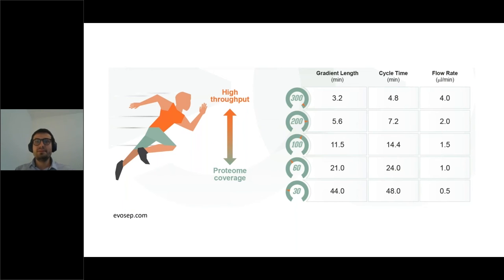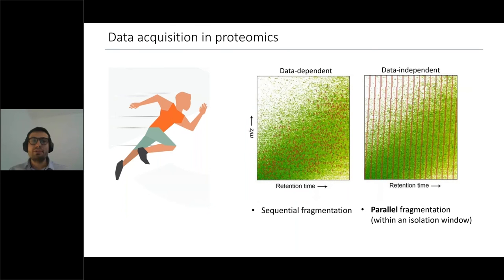And the other fact that I know about you is that you're not only interested in high speed, but you're also interested in high proteome coverage and data independent acquisition. So for the rest of the seminar, I will talk about why data independent acquisition is a good idea for short gradients. And I guess you've all seen many comparisons between data dependent acquisition and data independent acquisition.